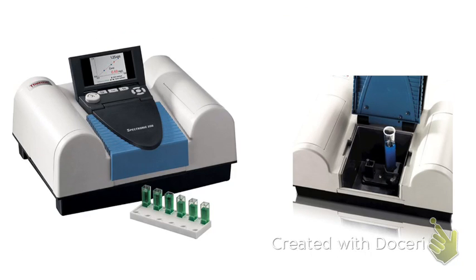Okay, so here's our spectrometer again. Here are some cuvettes that can be used. When we open up the spectrometer, there is a place where we put the cuvettes in. It's right there. This spectrometer can use test tubes besides cuvettes, but we're mainly going to use cuvettes. We just put the cuvette in that little slot that you see there, and you'll do that in your lab.